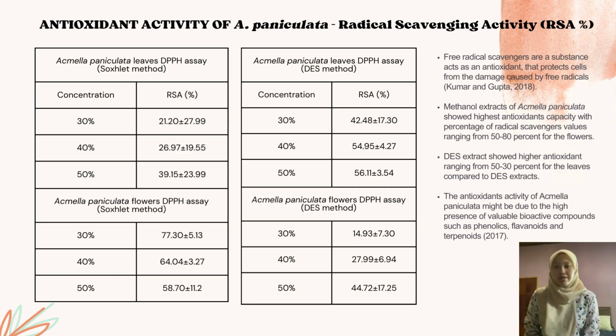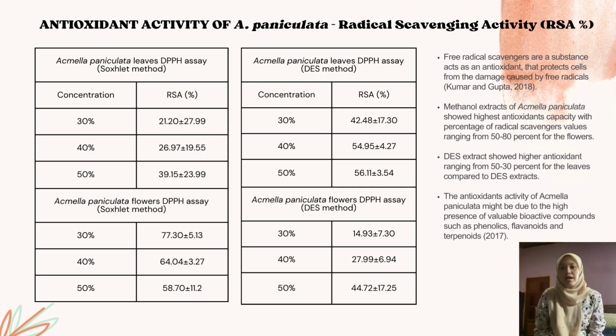We use ascorbic acid as a standard, as we know that ascorbic acid is one of the strongest reductants and radical scavengers, which will reduce the stable radical. The DPPH radical is scavenged by the Acmella extract with increasing concentration when compared to ascorbic acid.